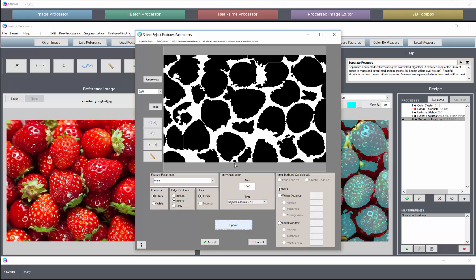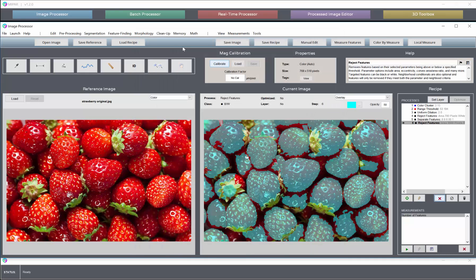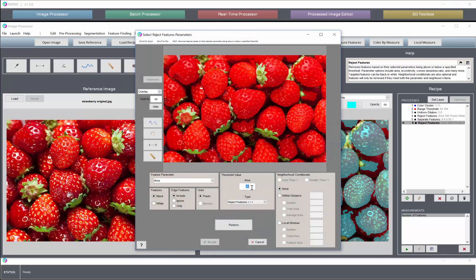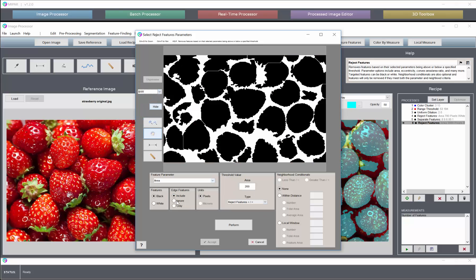But you see, we do have another small one that comes back, or a couple of them that were on the edge. So after we perform that filter, we then can go down to a much less aggressive size and consider all features.